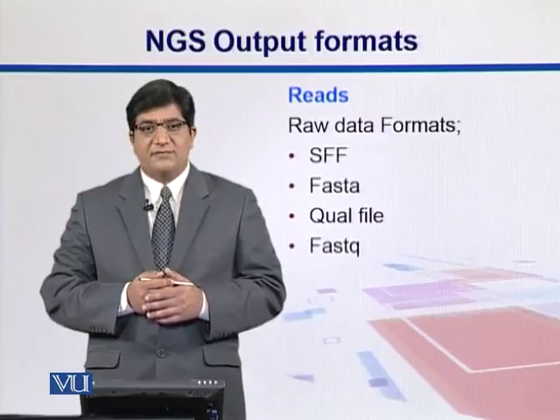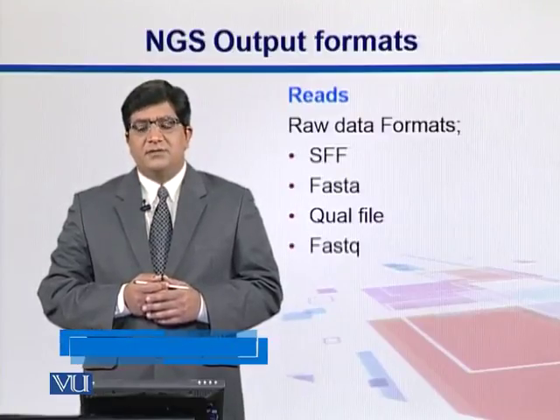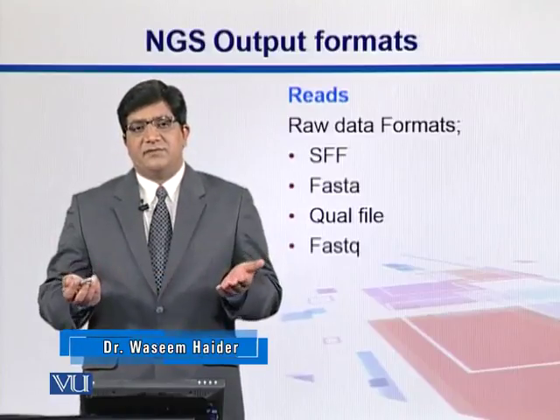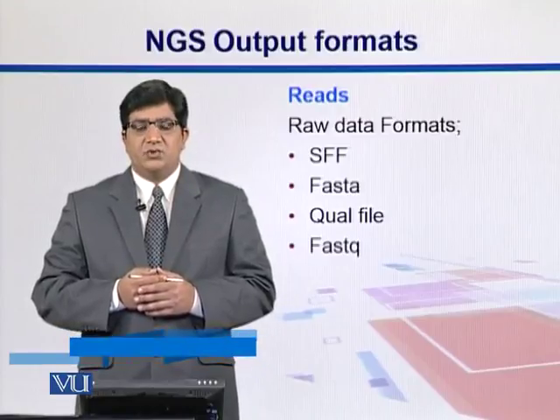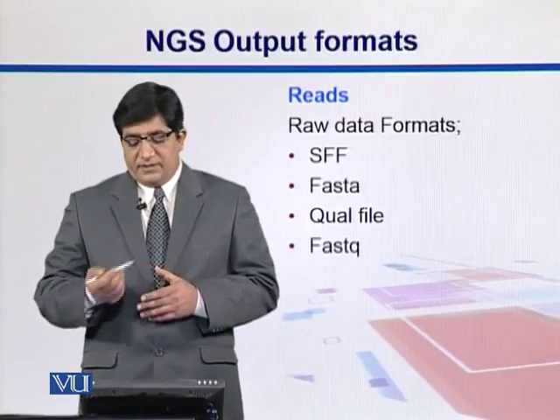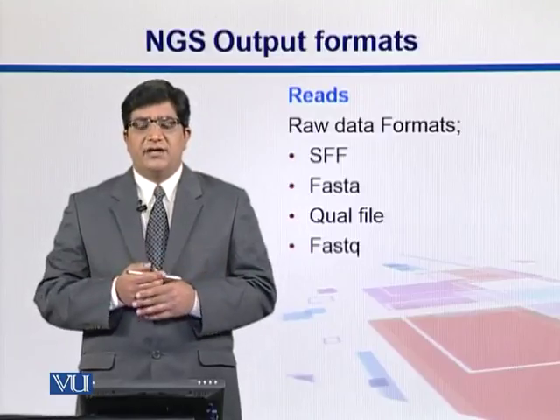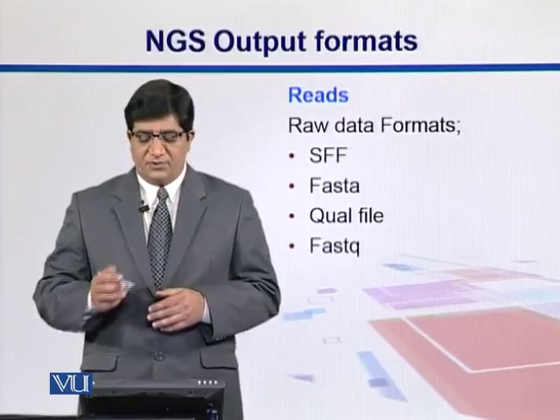Like SFF, the standard flowgram format produced by 454 machines. They can also give us data in FASTA files, and we can also have quality scores in separate files or in another format which is mostly used nowadays, FASTQ, where FASTA and qual files are put together.